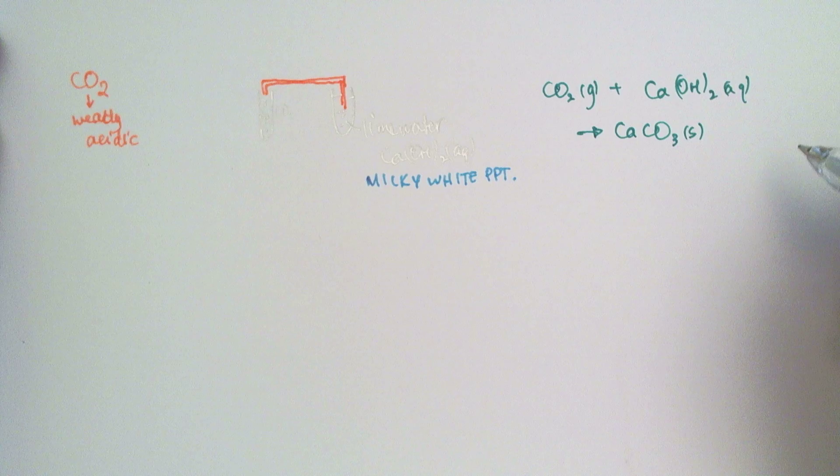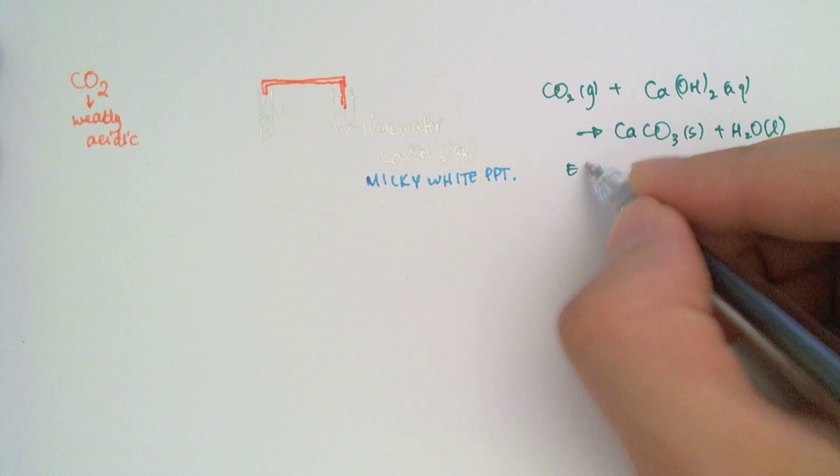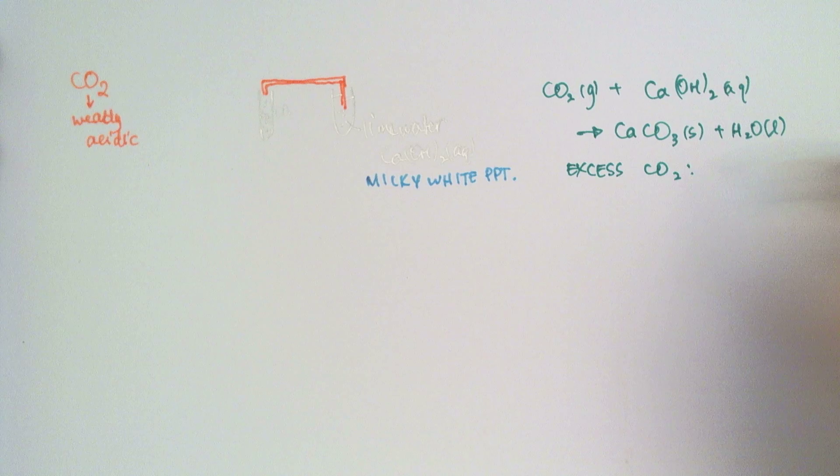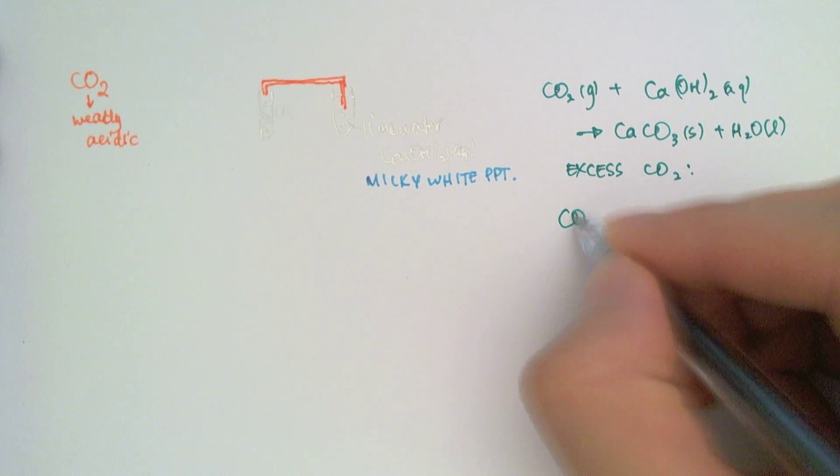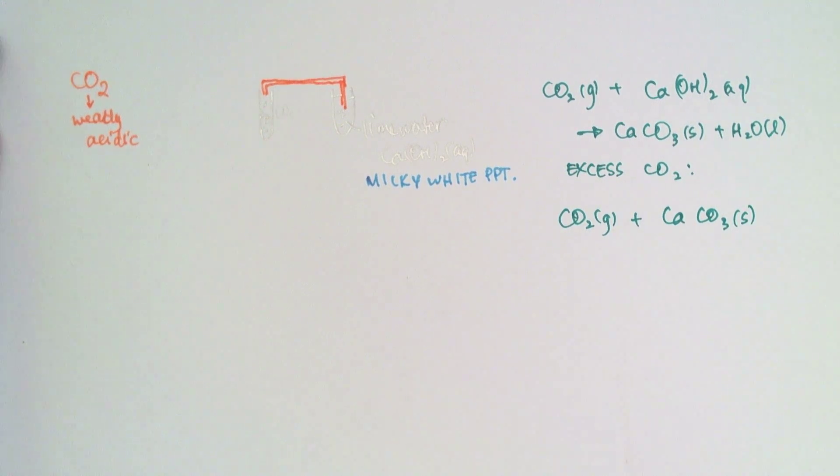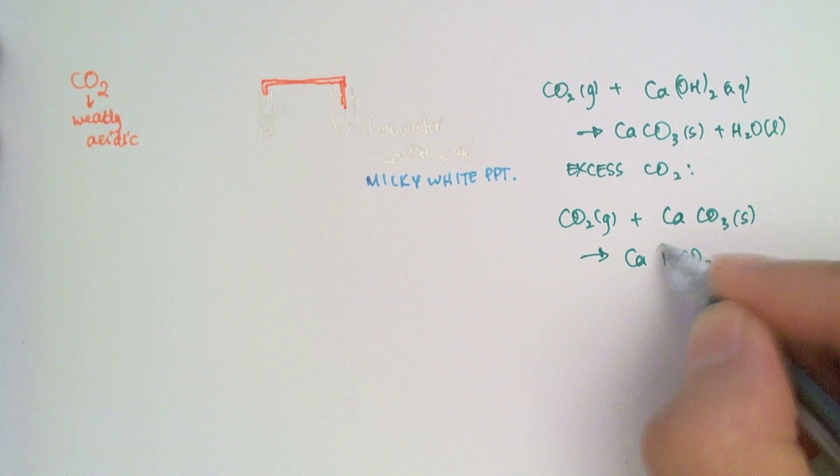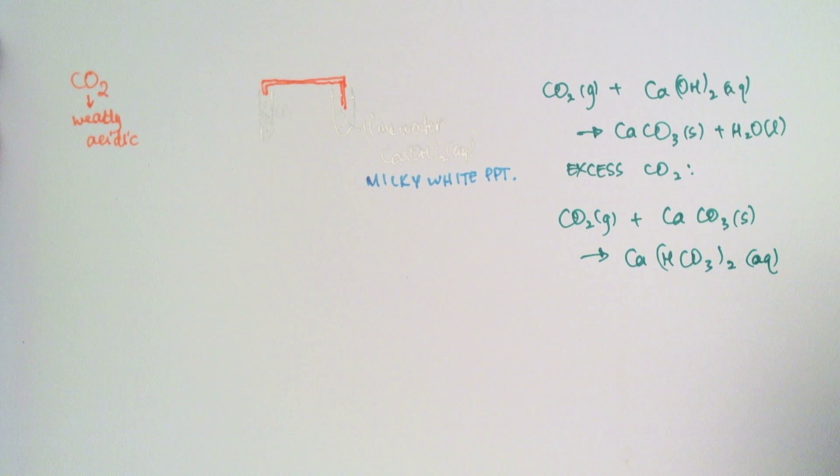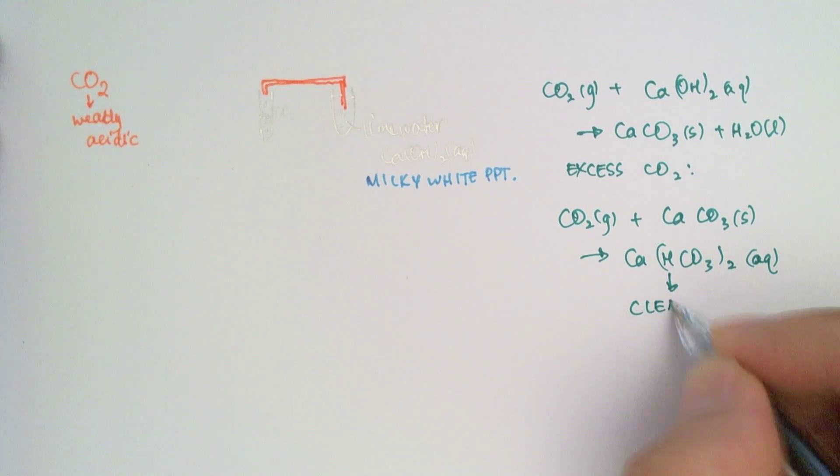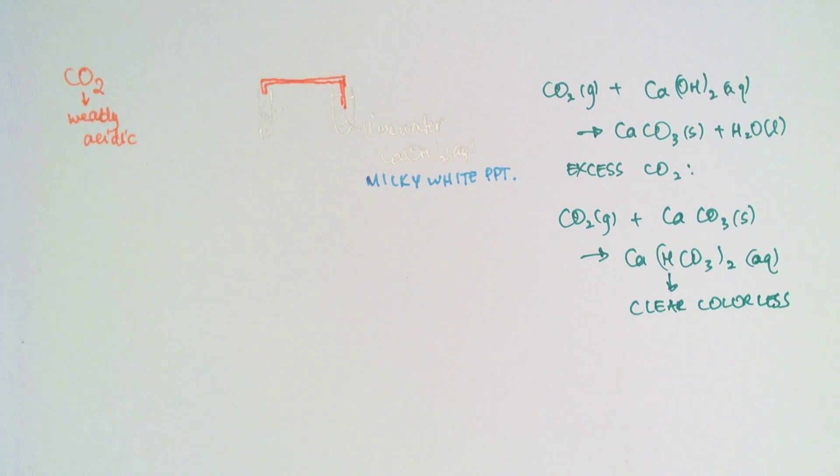So you have calcium carbonate precipitate formed with some water. Now it's important not to overdo this test. And the reason is because if you add excess CO2, what happens is that the excess carbon dioxide will actually react again with that white precipitate to give me calcium bicarbonate, and that's a clear color solution. So if you do it too quickly, you might not see the precipitate form at all.